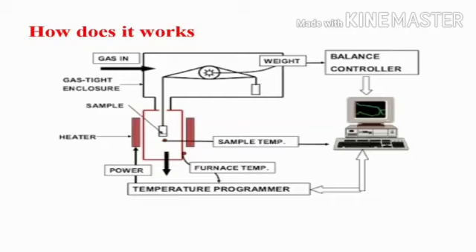During this movement, the mirror attached to the balance reflects the light at a certain angle. This deflection in the light beam is recorded by the computer, and the computer again sends the required amount of current to the magnet, so that the reference weight again moves in the upward direction and the mirror moves to its horizontal position.